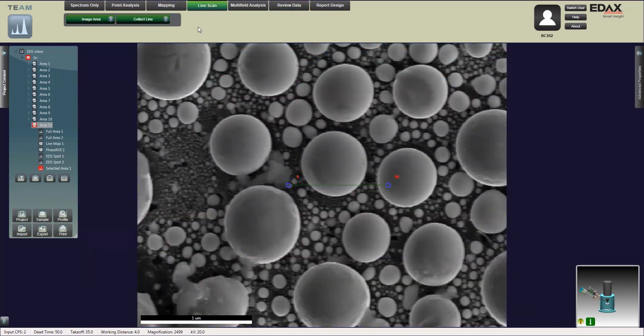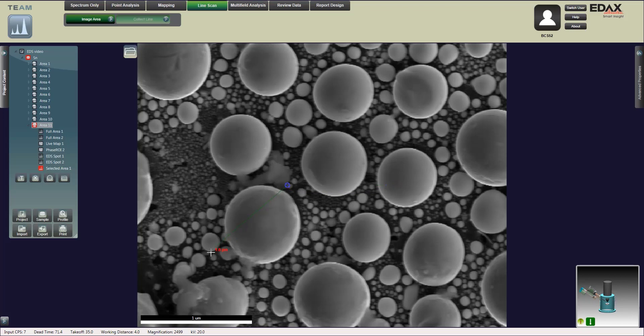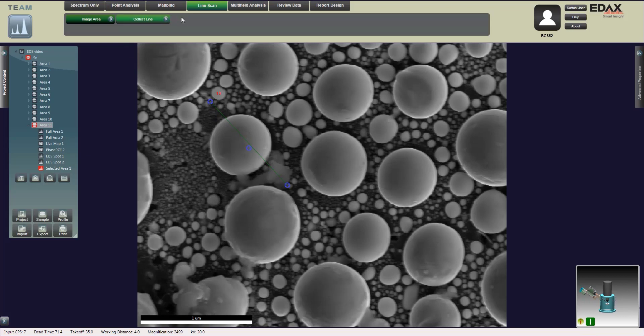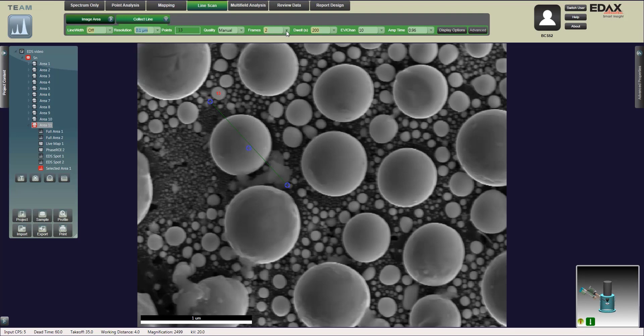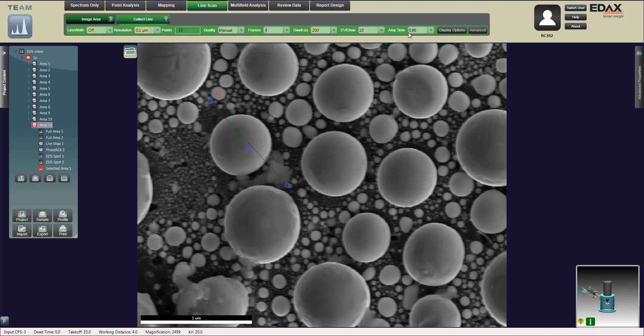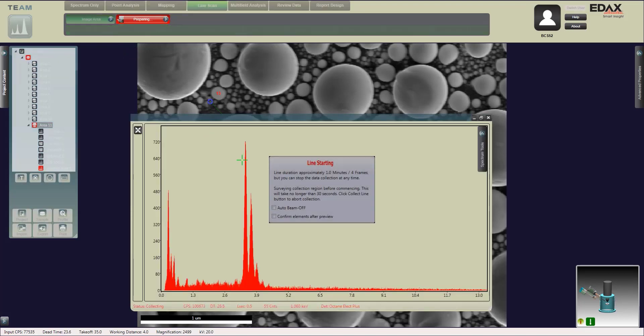Now we're going to move on to a line scan. This is typically used if you're looking at interfaces or a change of material on a surface. It's going to take a certain number of selected points within that line that you draw. You can change your resolution, the number of points, how many frames you want to do, dwell time, and the amp time set it up to have the correct amp time.